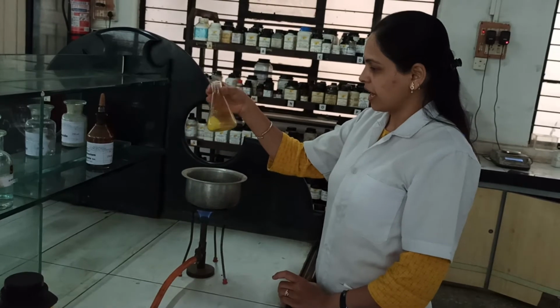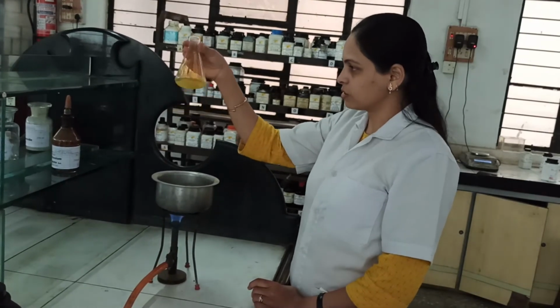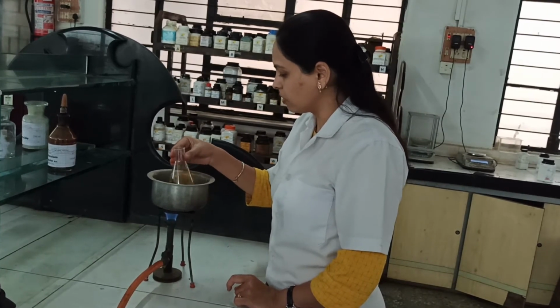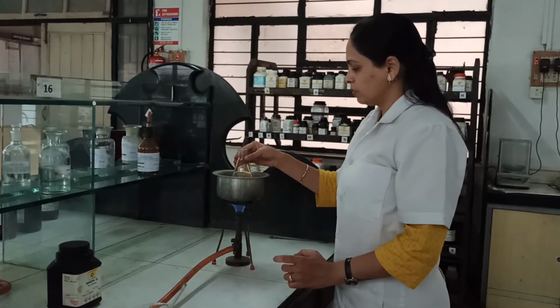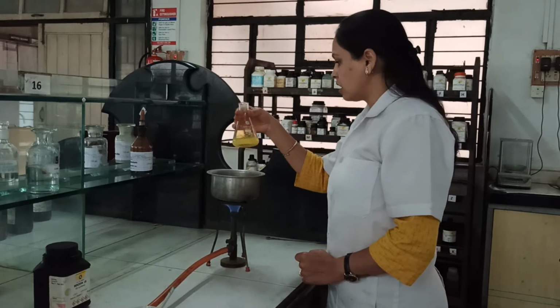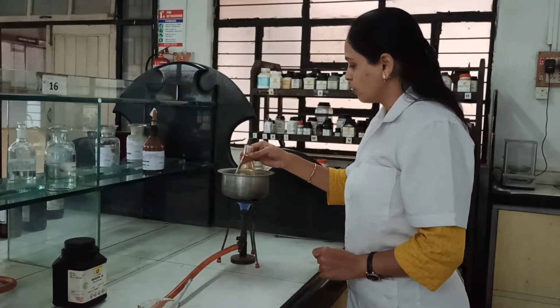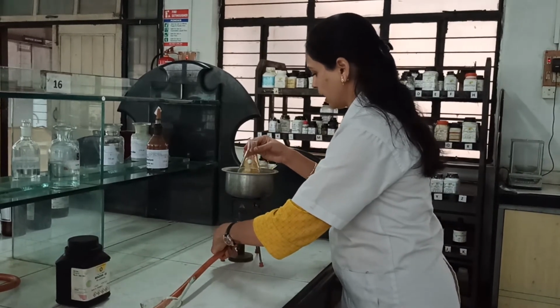Students, you can see the reaction mixture after about 45 minutes, the change in color of the reaction mixture and also the consistency. Now we have to heat it for 15 more minutes, so we will complete our 1 hour of heating. Students, now you can observe the reaction mixture at the end of 1 hour. There is a complete color change of the reaction mixture. Now we will stop the heating and proceed with the further practical.